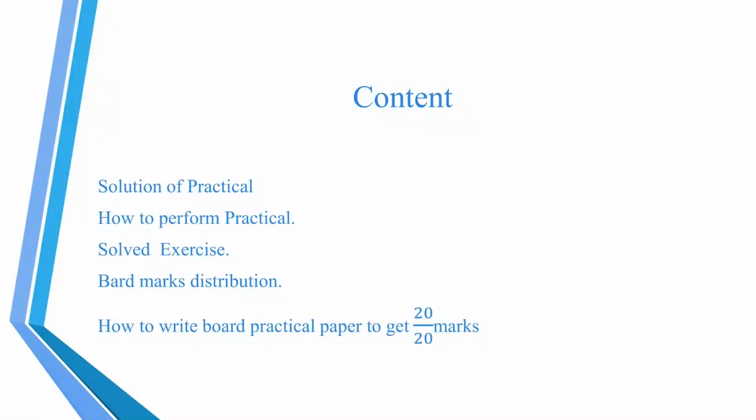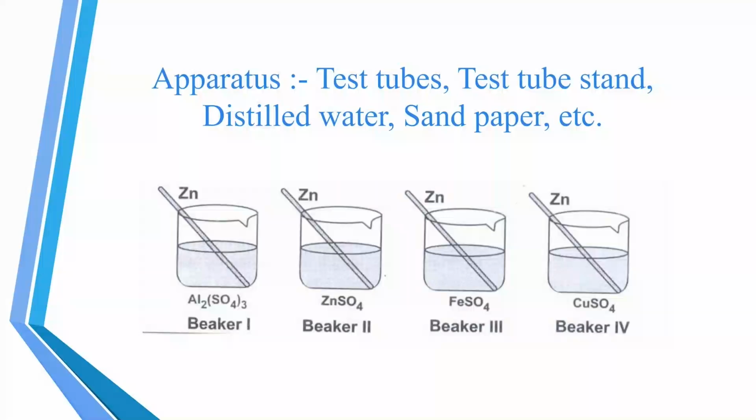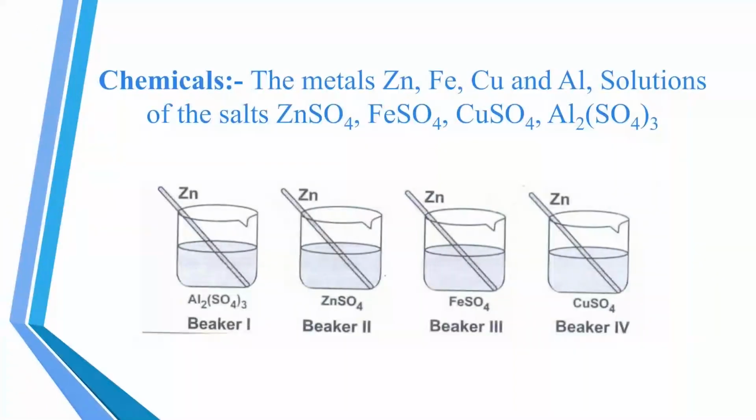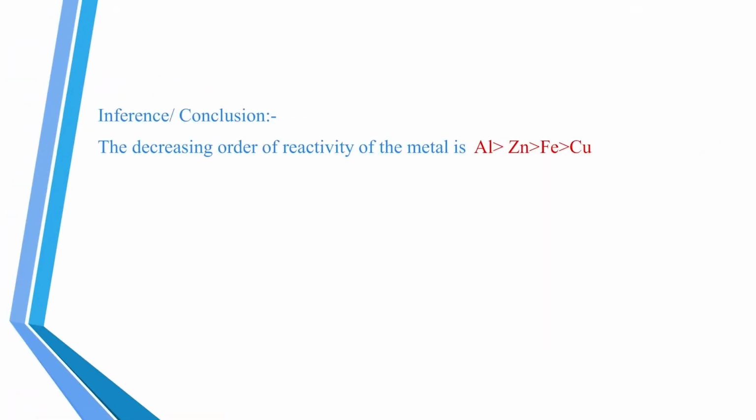Content of the video. Write the solution of the experiment in your journal in neat and clean handwriting with a blue pen.